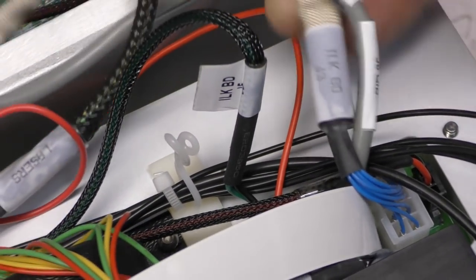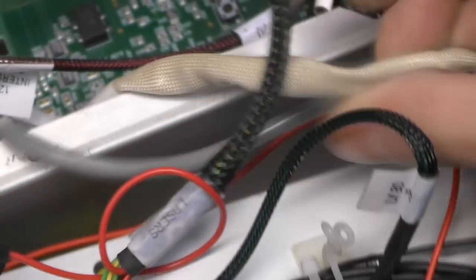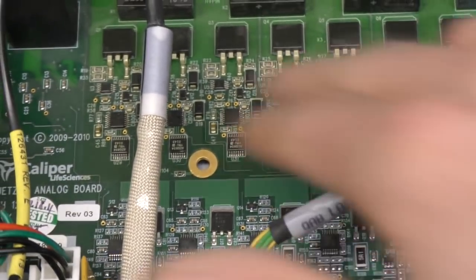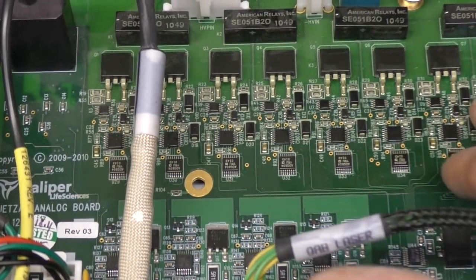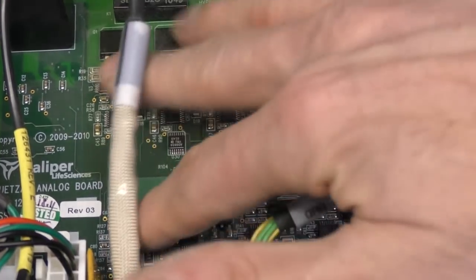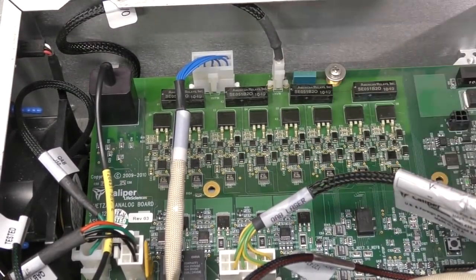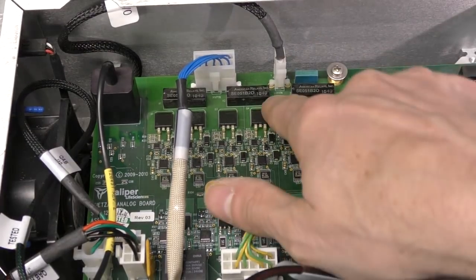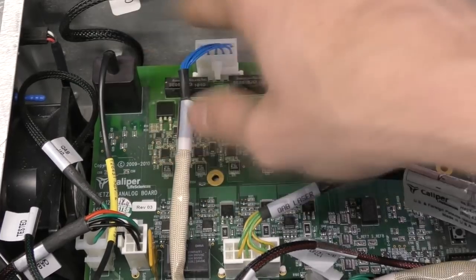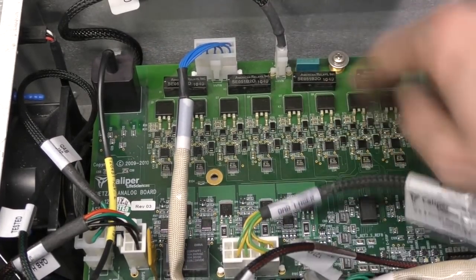I think this is probably going to be the high voltage. This has got, like, feels like silicone. So this is just additional insulation coming from over here, and there's a whole load of, I'm guessing, MOSFETs plus reed relays, and this whole area of the PCB is conformal coated, so this is clearly the high voltage. In fact, there's a label on there that says -HV in, so there's probably a high voltage power supply underneath there that's supplying this section.